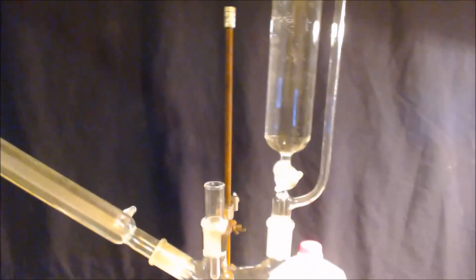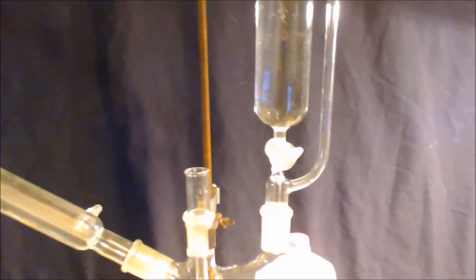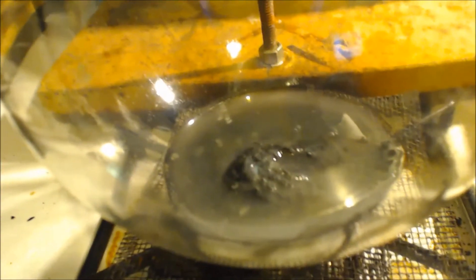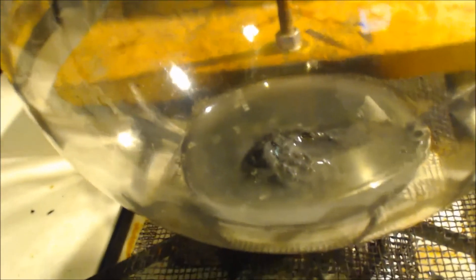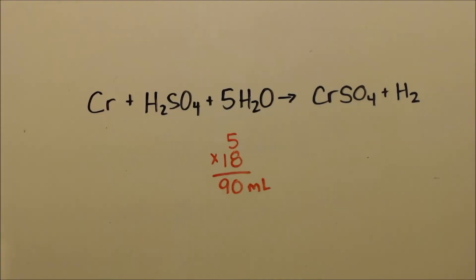Well, I just added another 200 milliliters to that flask there that had the concentrated sulfuric acid. I looked in my notes and it says that if you have it too concentrated, some of your sulfuric acid will break down into SO2 and water instead of hydrogen. So I want to make it more. That's why when I was doing that other little sample, I said, man, that smells like sulfur, because it was SO2.